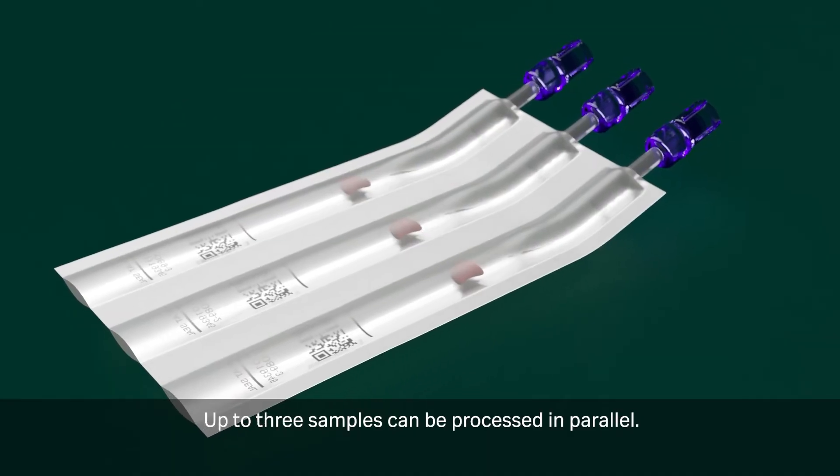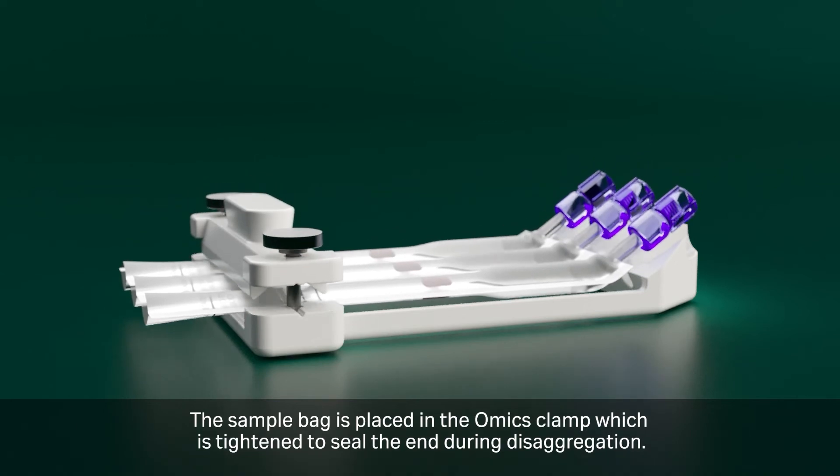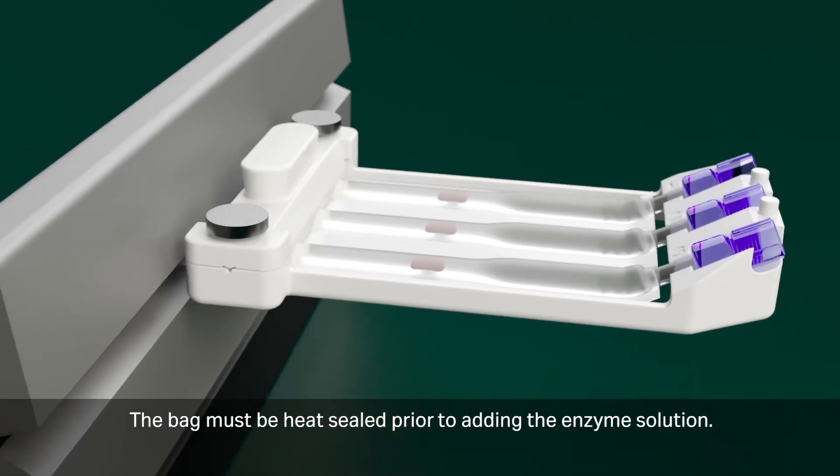Up to three samples can be processed in parallel. The sample bag is placed in the Omics clamp, which is tightened to seal the end during disaggregation. The bag must be heat-sealed prior to adding the enzyme solution.